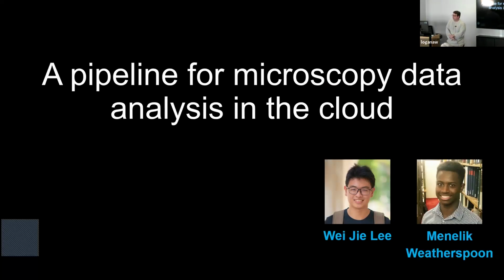Very interesting talk. I was curious, for the software, is the only dependency the camera APIs, or if I have a different microscope setup, would the software or pipelines apply? Yeah, there's a bunch of dependencies because it uses Linux base libraries and networking libraries. But other than the standard C++ libraries, the only dependencies are the camera control library.